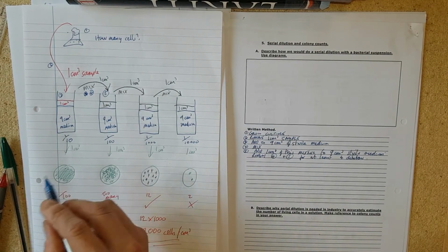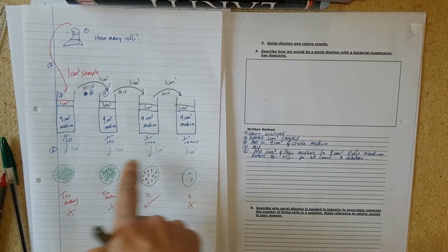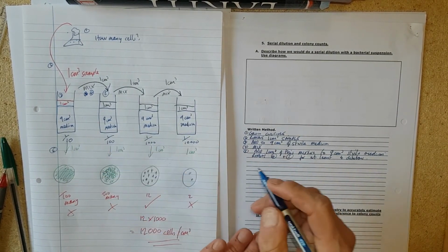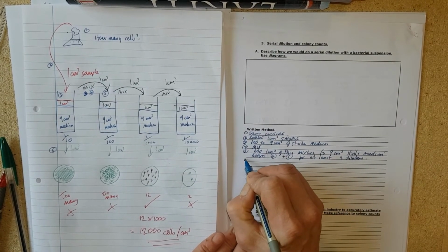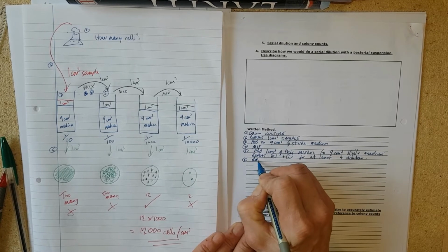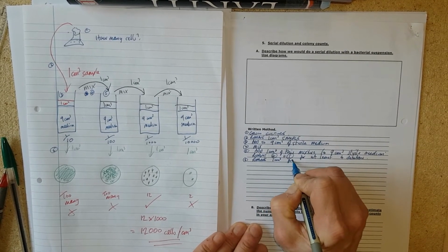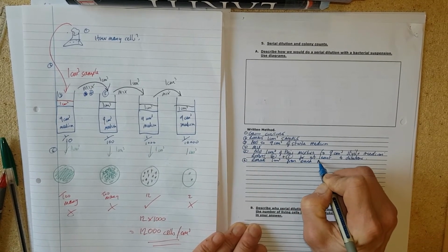Then step 6 will be to remove 1 cm cubed out of each culture. So step 6, remove 1 cm cubed from each mixture.